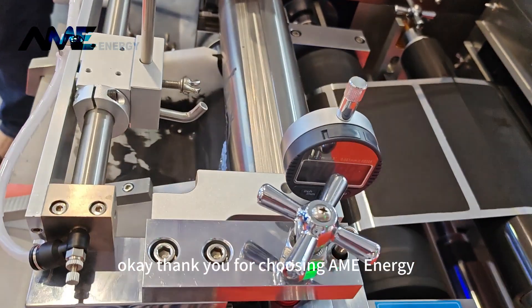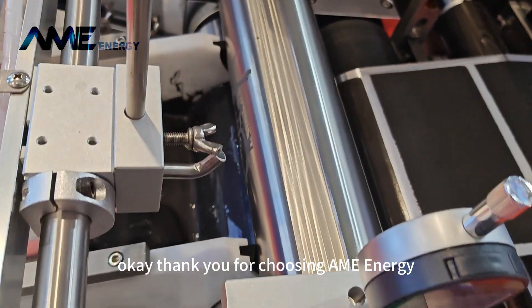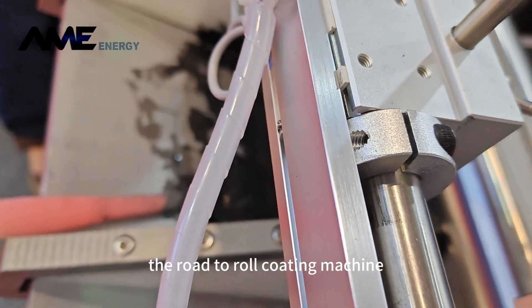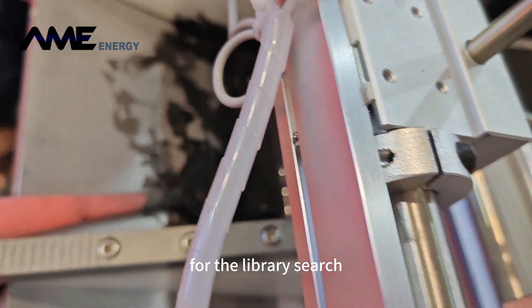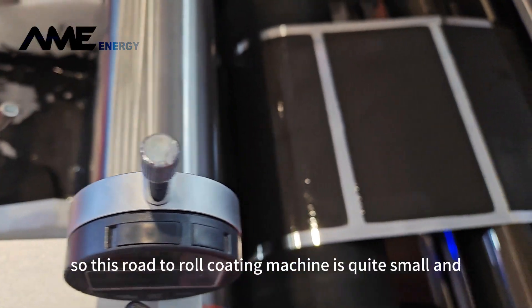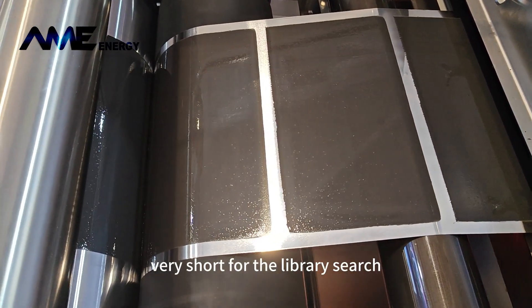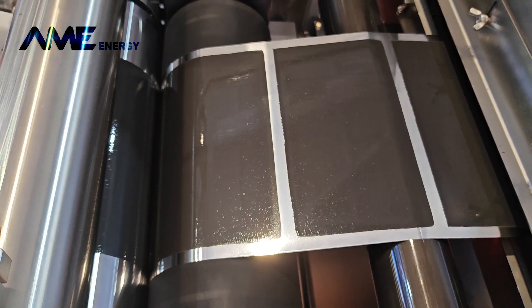Thank you for choosing AME Energy. Today I'm going to introduce you to the roll-to-roll coating machine for the laboratory research. This roll-to-roll coating machine is quite small and very compact for laboratory research.